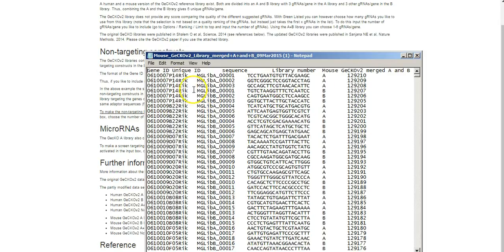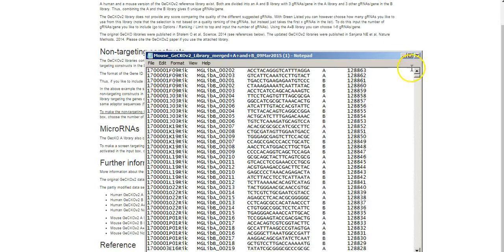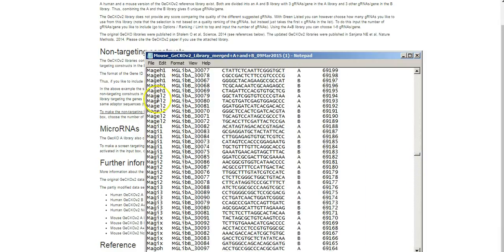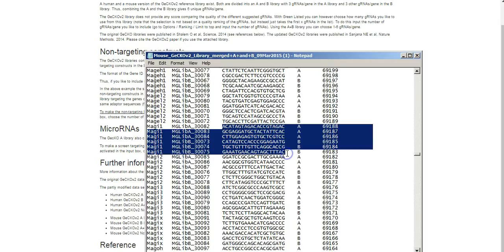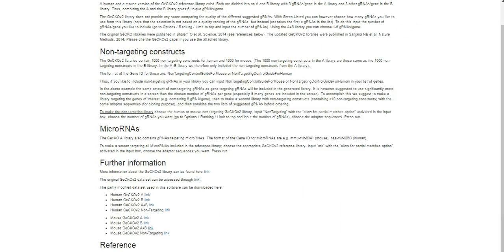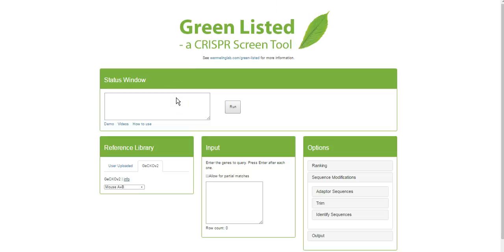This shows how a reference library looks. In the first column you'll see different genes, and in the subsequent columns you'll see the suggested gRNAs for each gene. So basically, if you input and say you want to target MAGI1, the software is going to come in here, collect those six corresponding gRNAs for that gene, and then add adapter sequences. It's not that complicated, but it's very useful when you want to target a large set of genes — doing this manually introduces a risk of errors, and this is much faster.